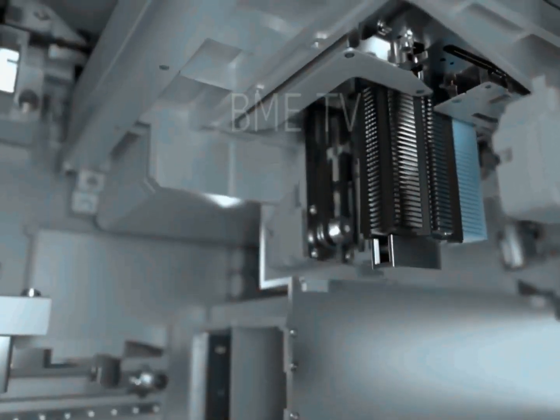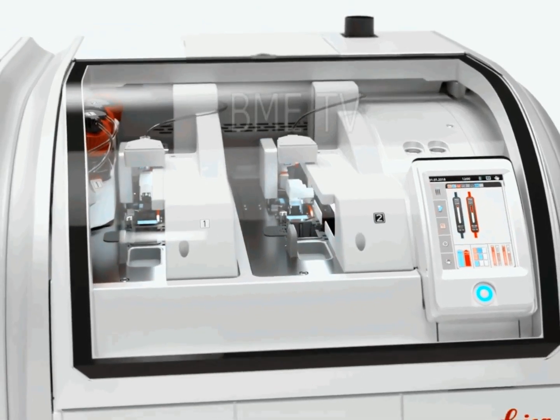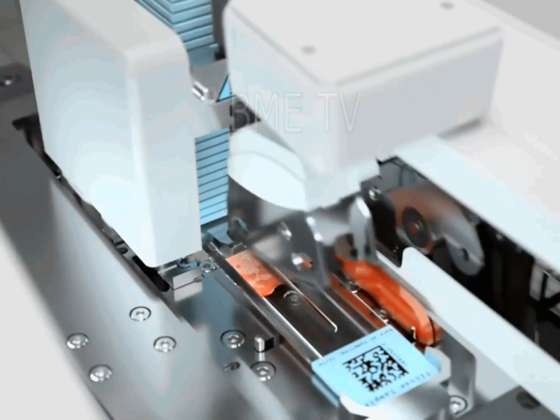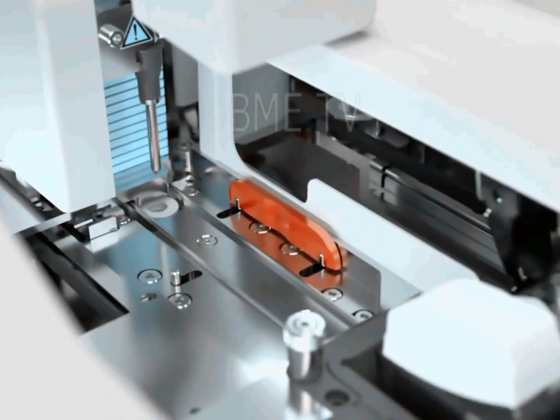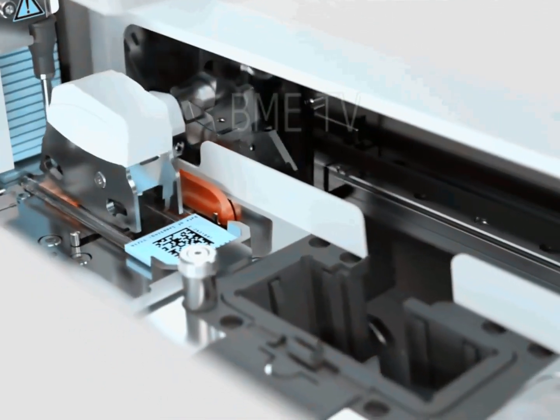The advancing slides press a switch as they pass each staining station, activating a pump. This principle has been applied more recently to PAP and H&E staining. Because each advancing slide triggers stain application individually, the Platen-type stainer is a linear stainer. The stain is discarded after the slide moves to the next station, so the bulk containers of stain are not contaminated.